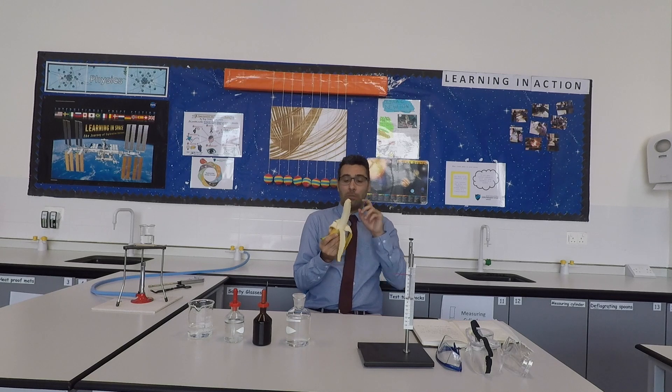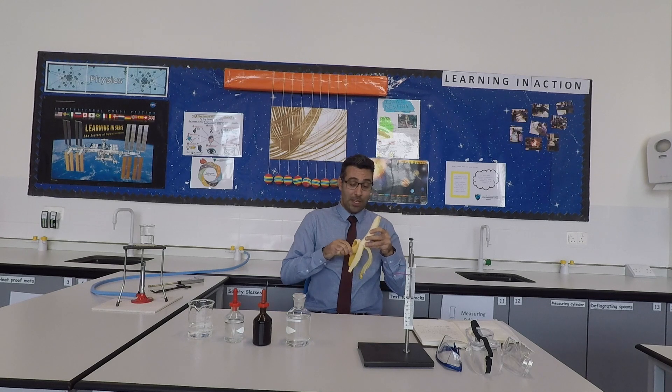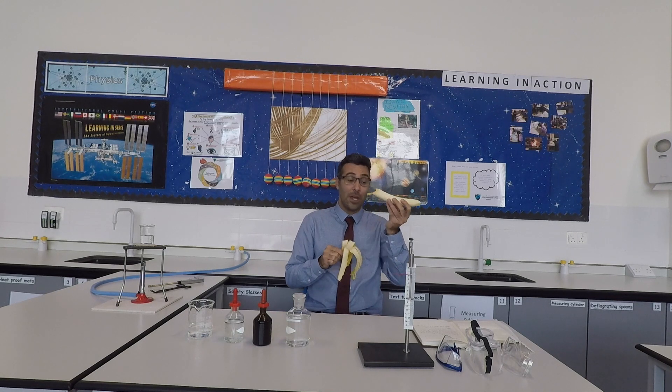I'm not going to have this now. I'm in a science lab, so I'm not allowed to eat or drink. So what I'm going to do — I'm going to put the food away.